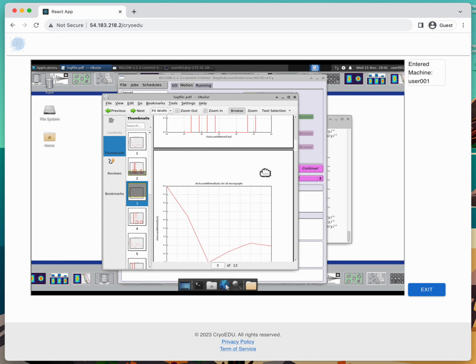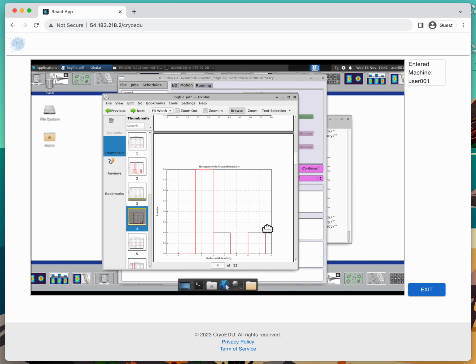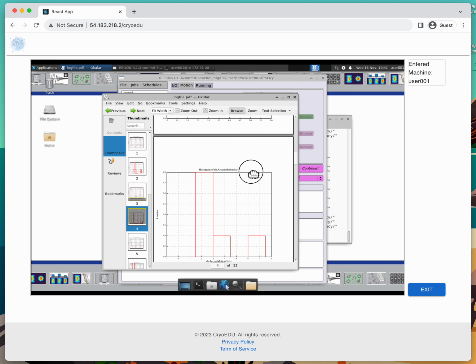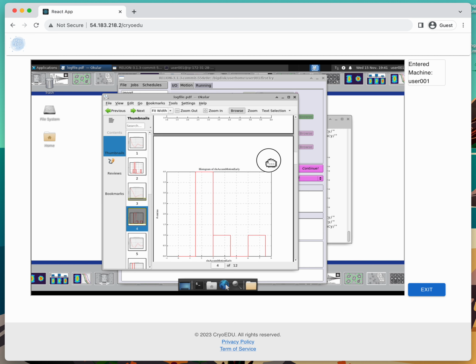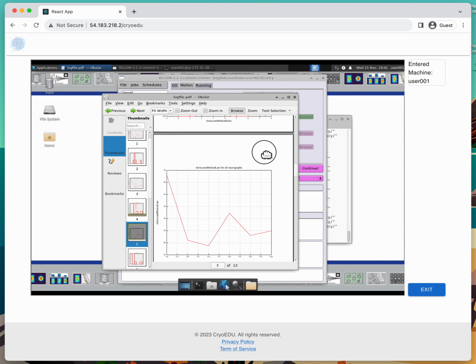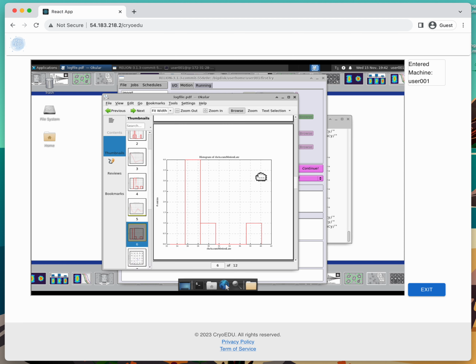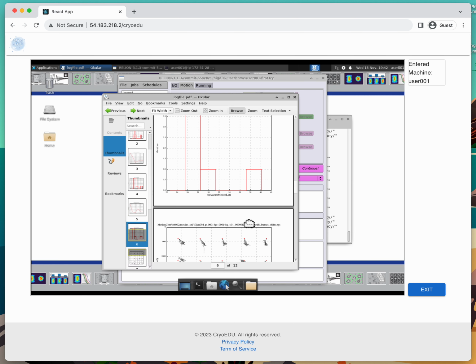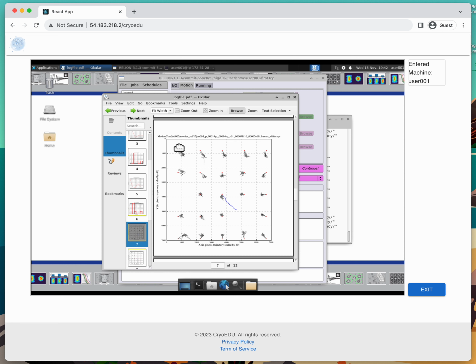There's another parameter it looks at, which is the early motion. Again, indexed across micrographs, then a histogram. And again, you see that this first movie had more. And if we go down a little bit further, this is now what they call late motion, which again, clearly this first movie had more motion the whole time, whereas the other ones were more close together. And then finally, just to show you what it did, it will plot a few different things for every movie.